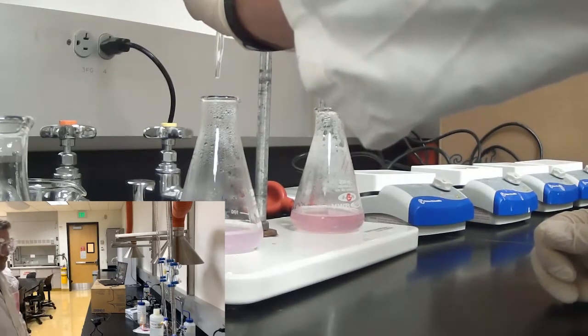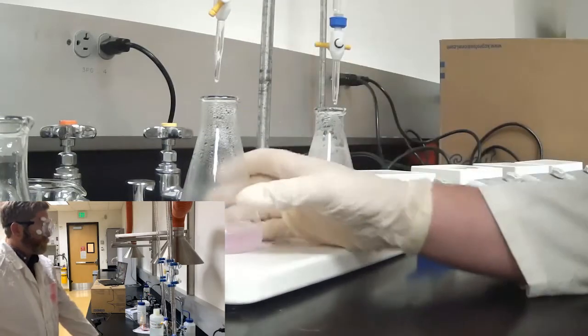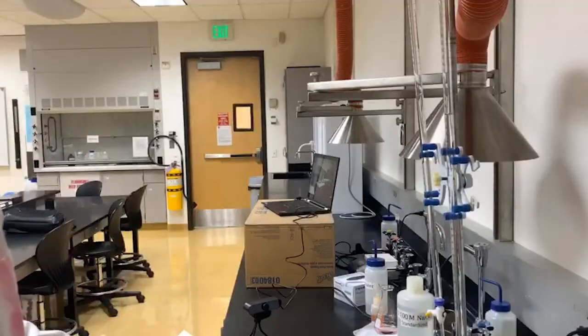Alright, so we've eliminated our color from both of them. So we're ready to take our burette readings. Sorry, I lied. Gotta move this one more time. Okay, so this is our first burette reading for the Erlenmeyer flask labeled B, which was our first sample. And so you look at the bottom of the meniscus and take your reading. And then this is for the Erlenmeyer flask labeled C, which was our second sodium bicarbonate sample.